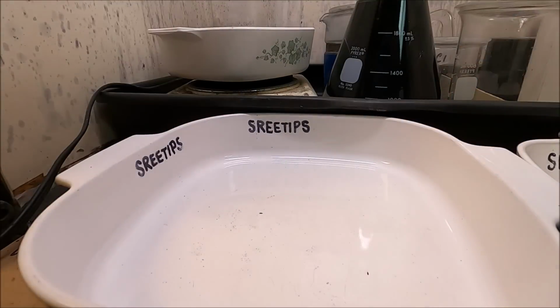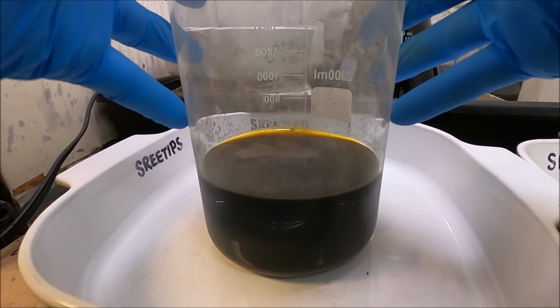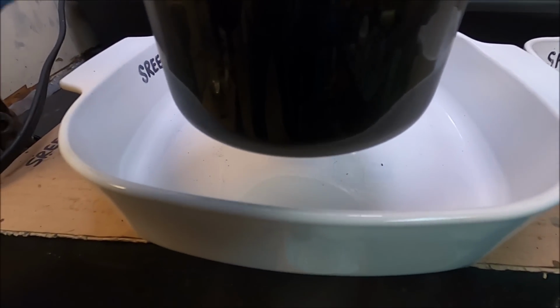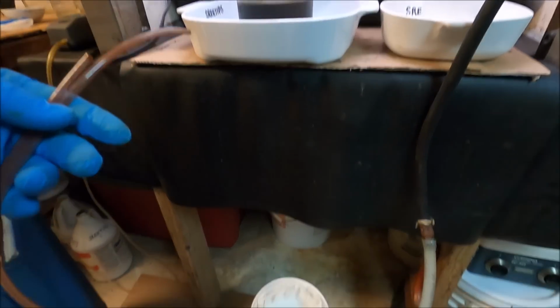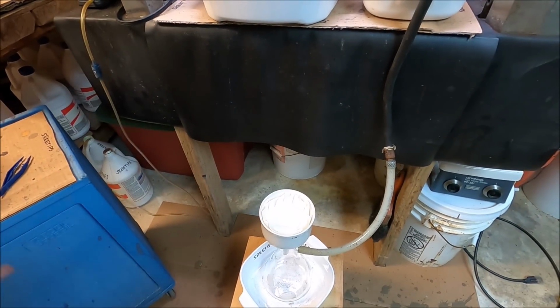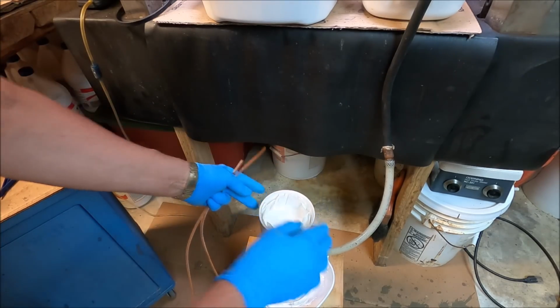And now what we'll do is bring our main beaker down here and take a look and see what we got in here. Right, I've got a little bit of solid material left in the bottom down here. But what I'm going to do now is, I've got a tube of water here, and I'm going to siphon everything down into this filter flask with one of my specially prepared filters in it that rides up the side of the funnel there, so we can get all the solid material in here.